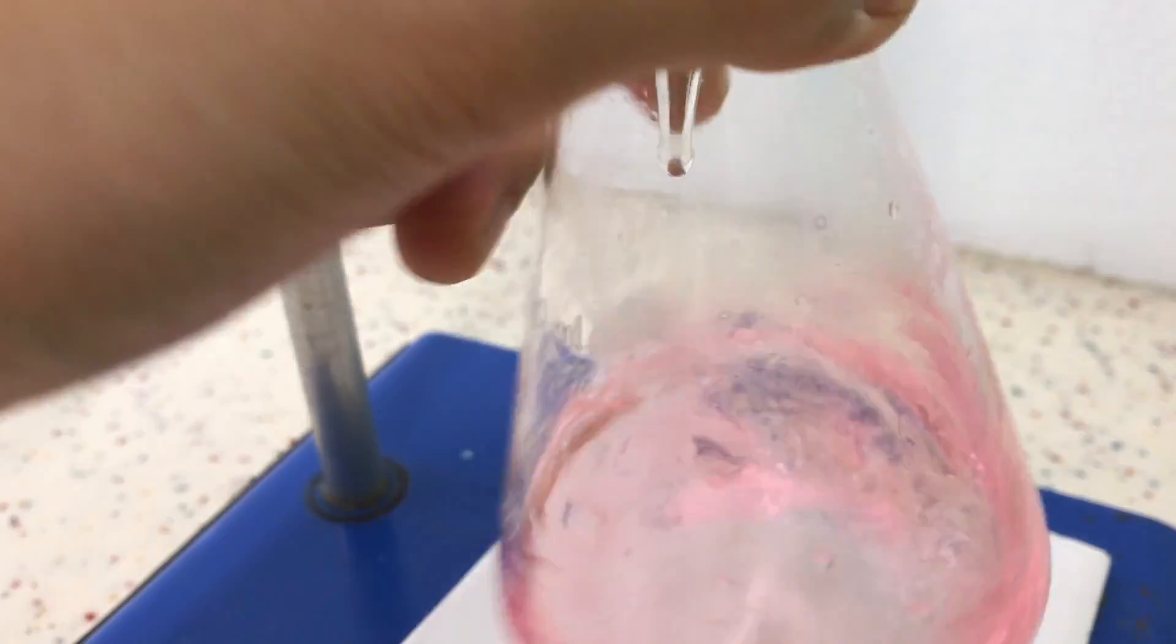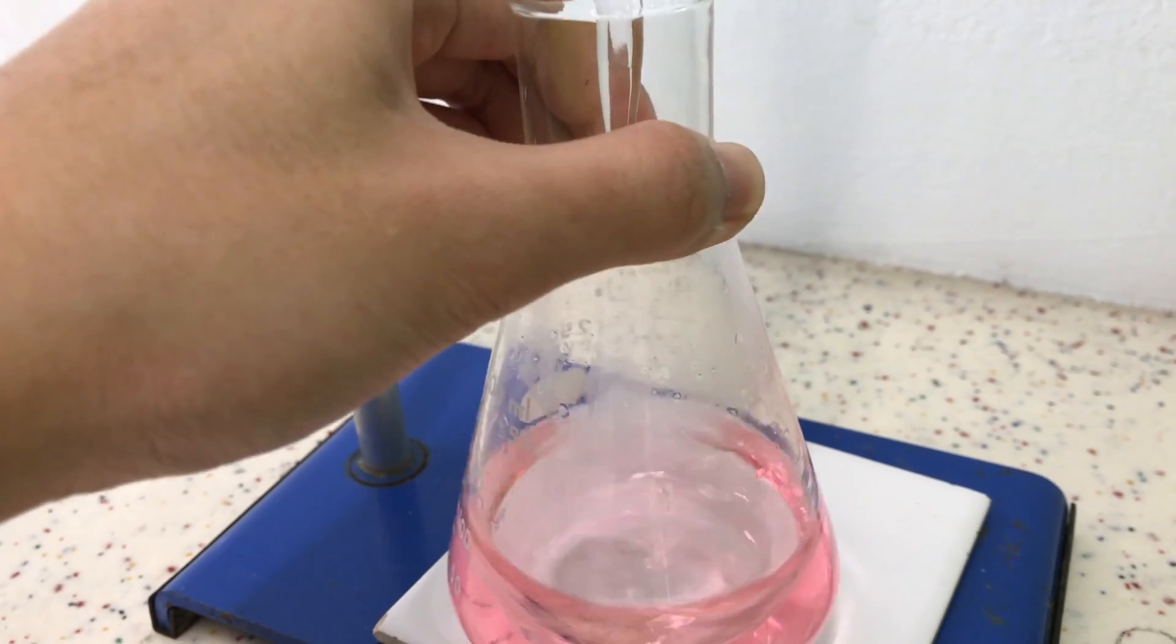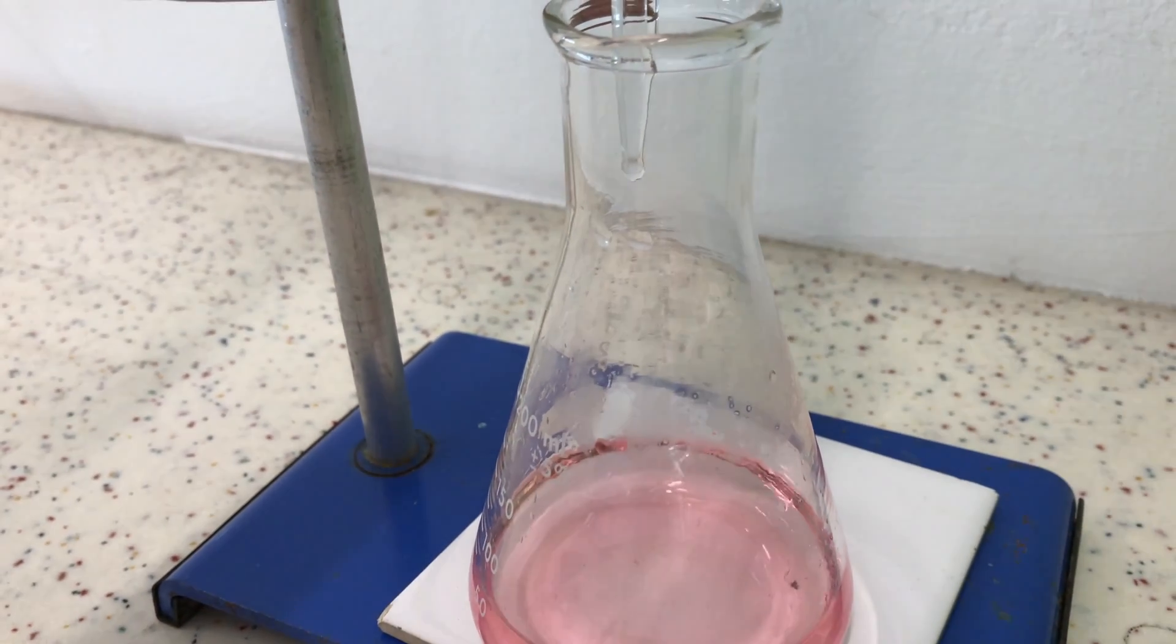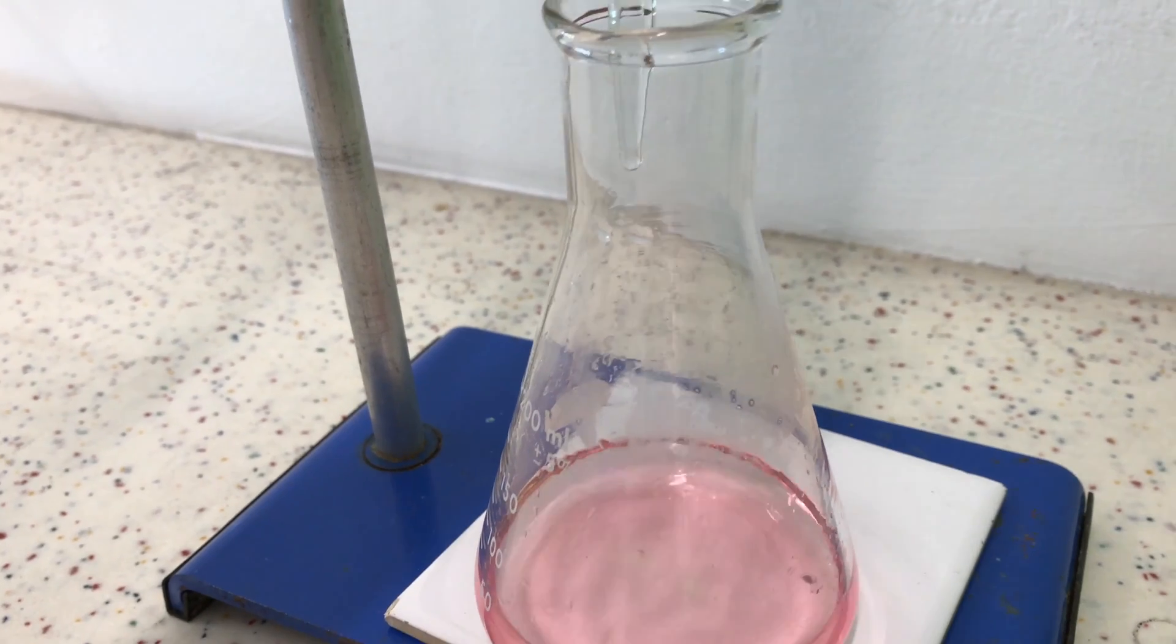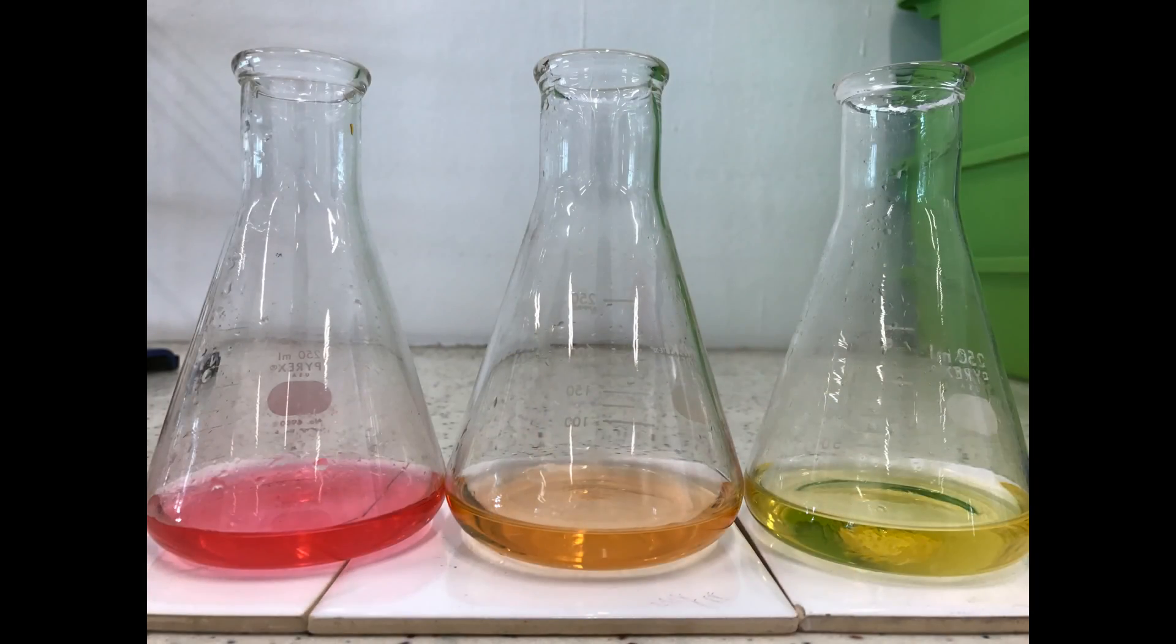We will gently turn on the tap to allow one drop of titrant to enter the conical flask, and then swirl carefully after every drop. We will continue to do dropwise addition until we reach the end point. In this case, the end point colour change should be from red to orange.